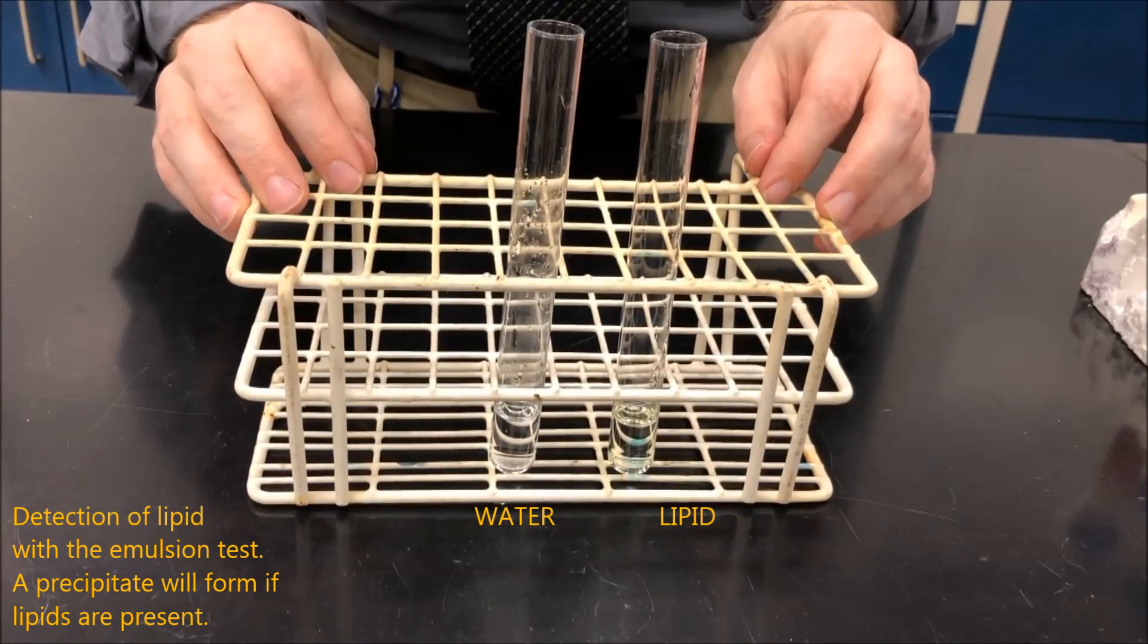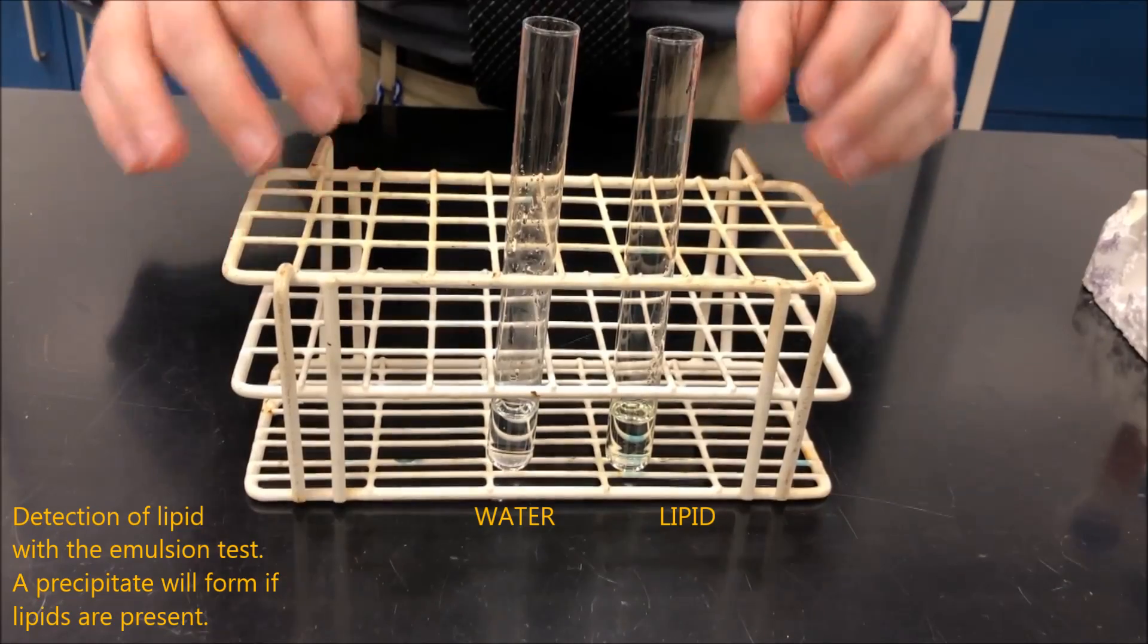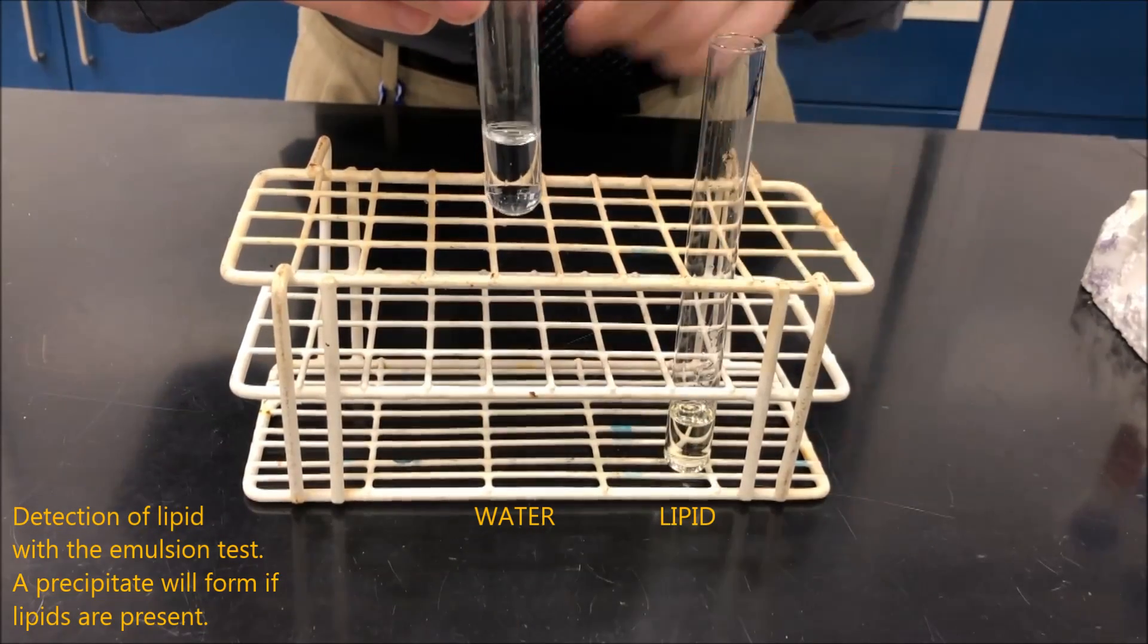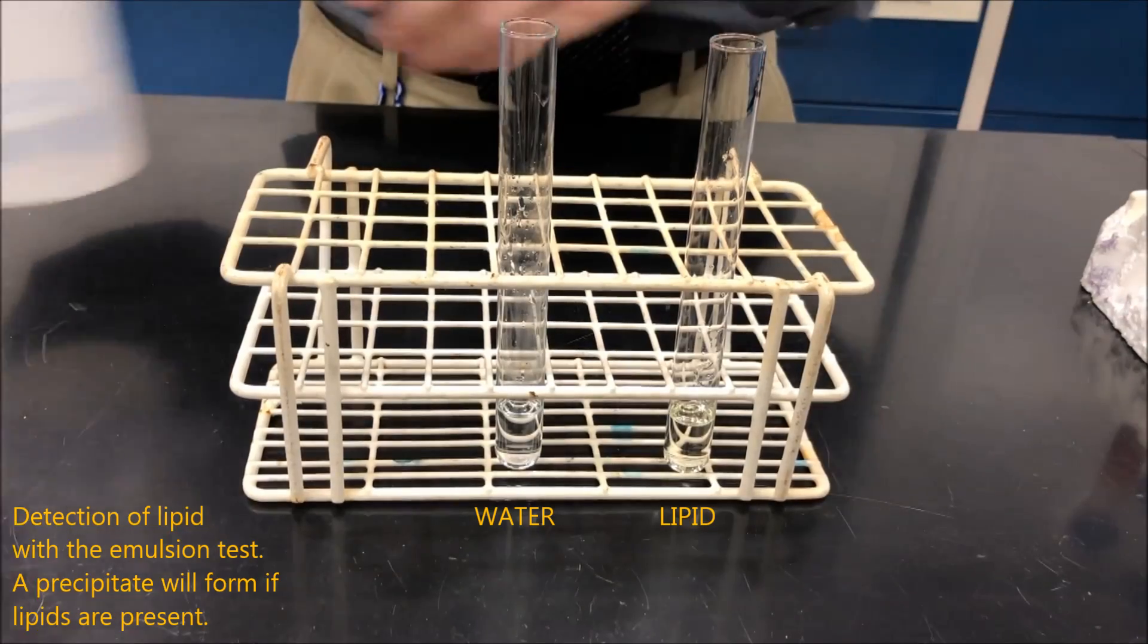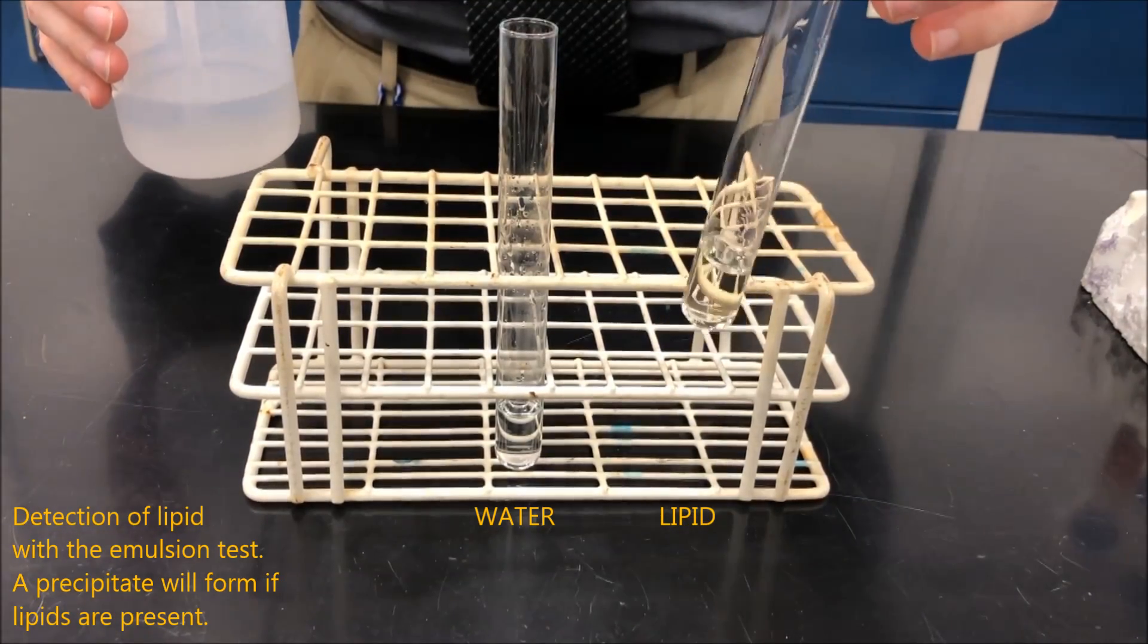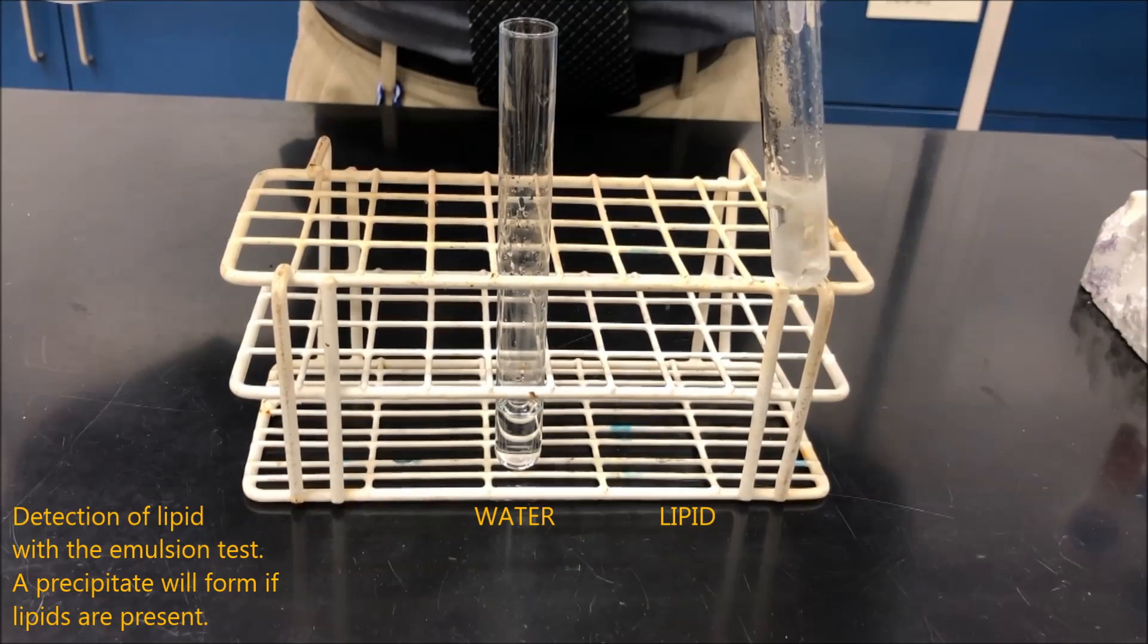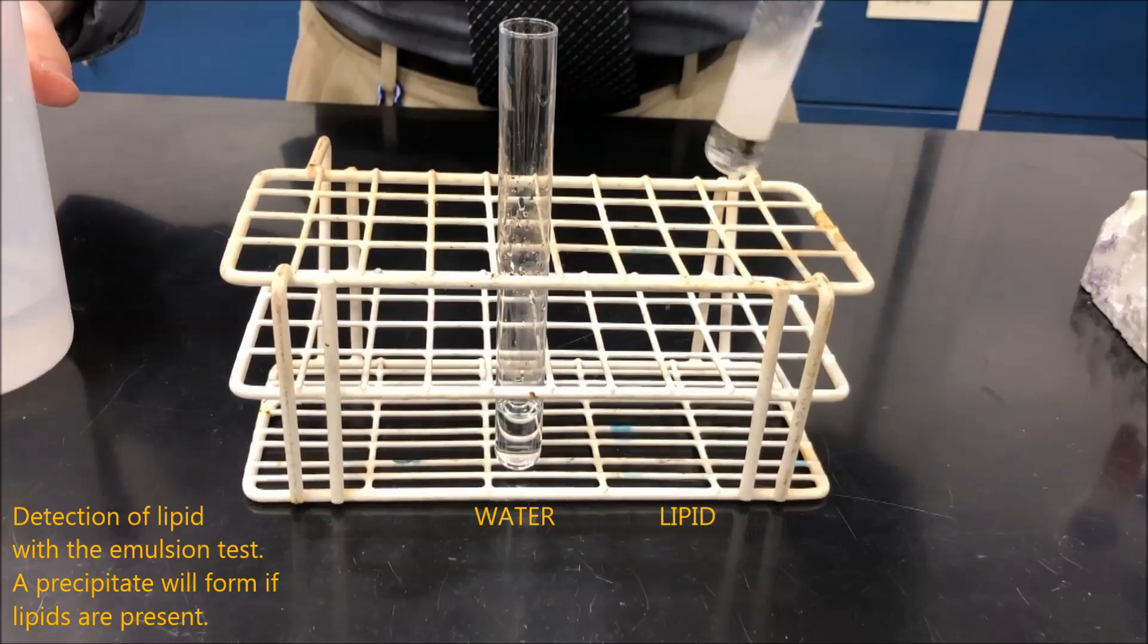To detect the presence of lipids, we can use the emulsion test. So here I have two test tubes. One contains some vegetable oil, lipid, and as a control we have some water. So the first step is to take our substance that we think has lipid in it, and we're going to add a small amount of alcohol. I'm going to mix that up.